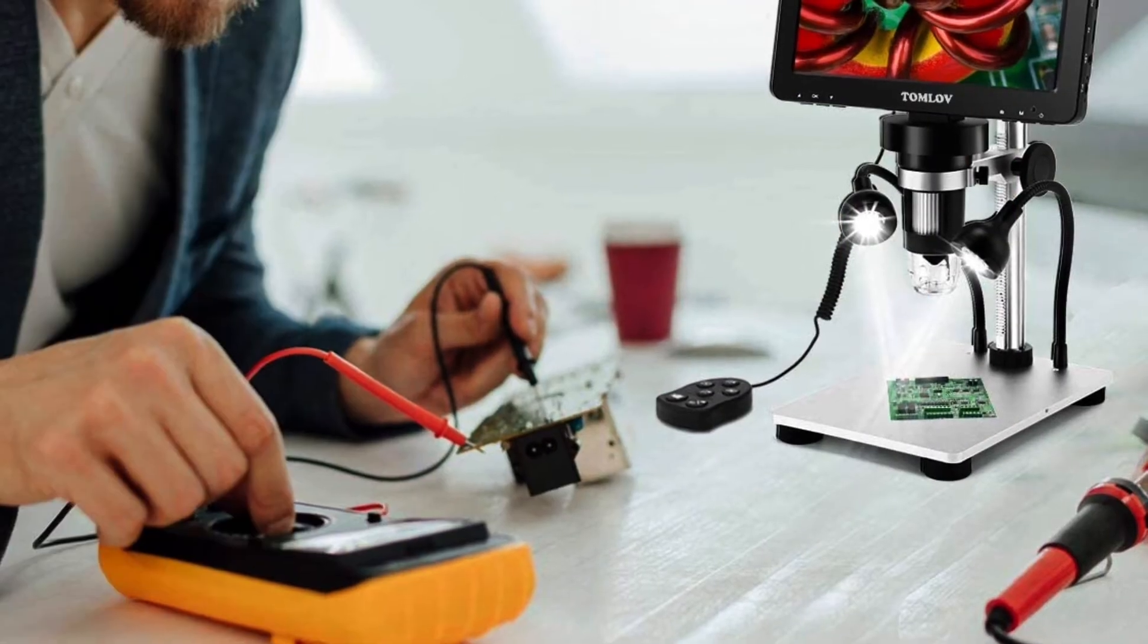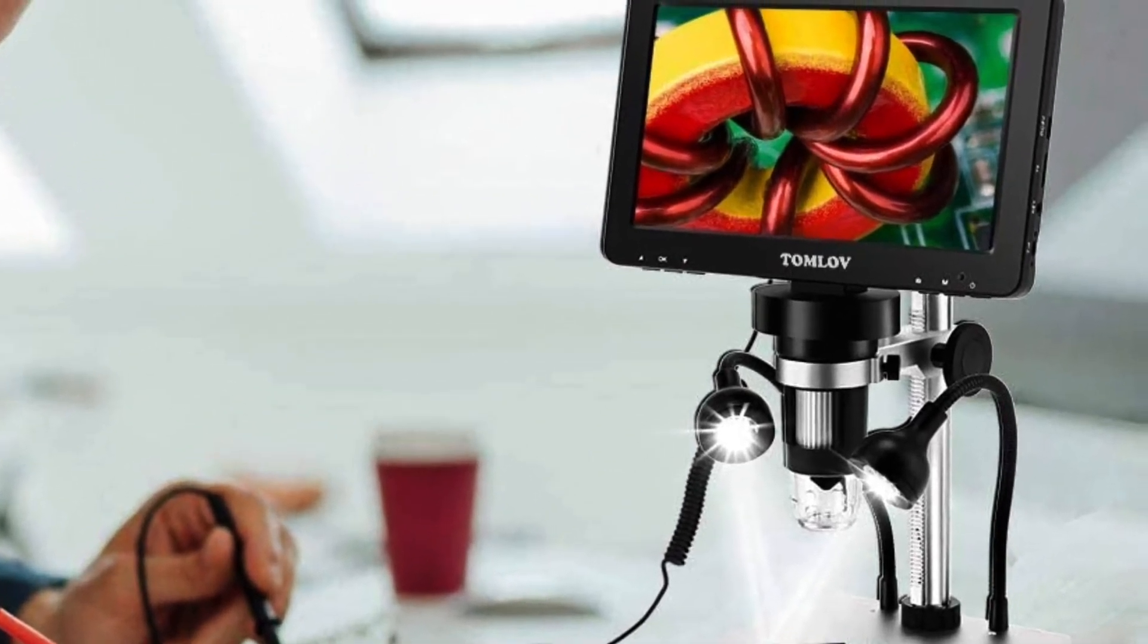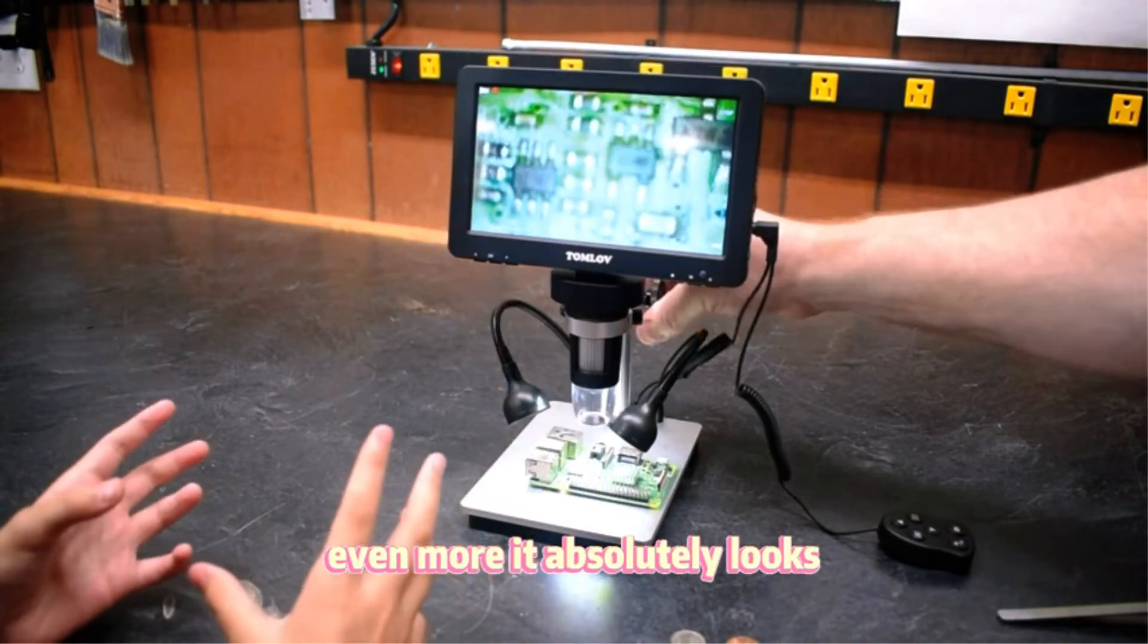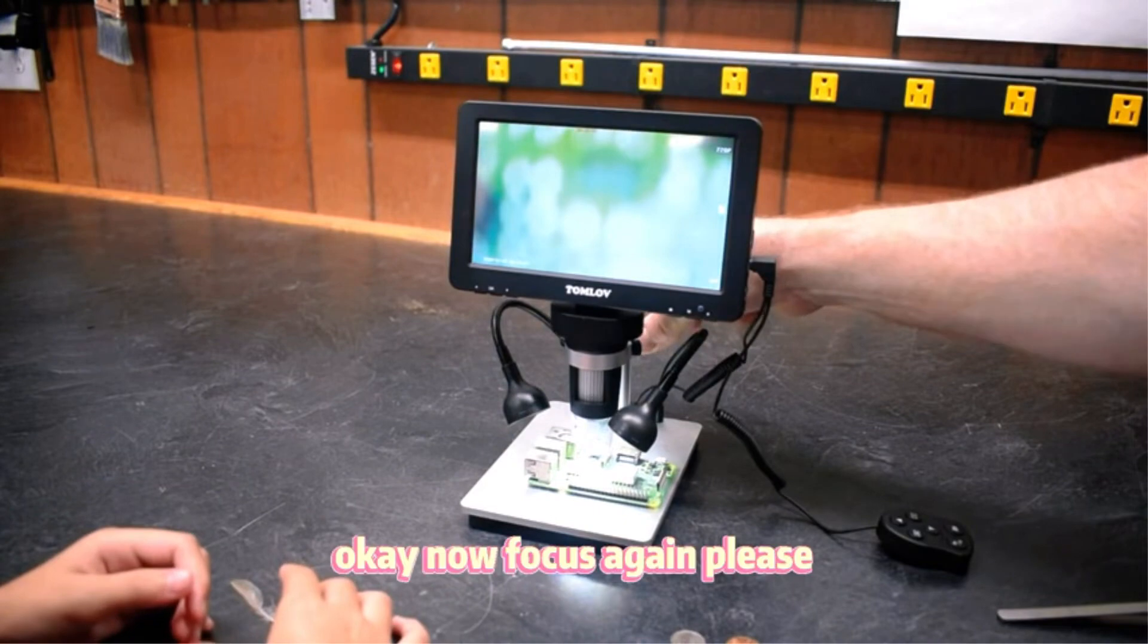Tomlove's digital USB microscope offers various handy features to the user which make it highly versatile. Starting with its display, you will find a large 7-inch screen on the front. This screen can be handy for viewing its 12MP camera that supports 1080p video.